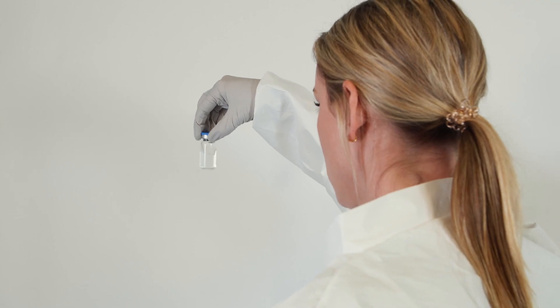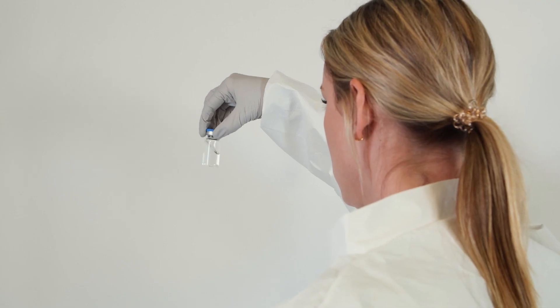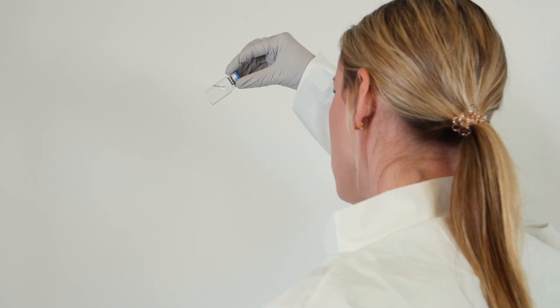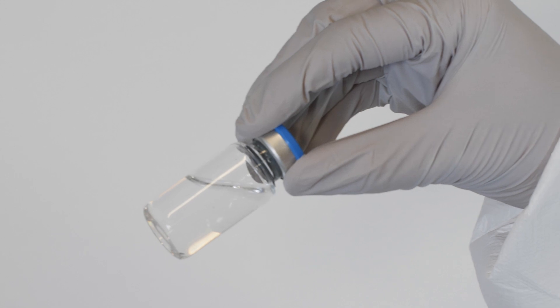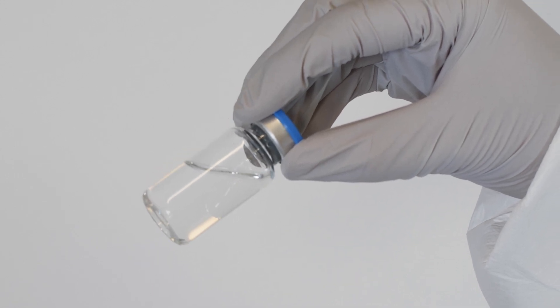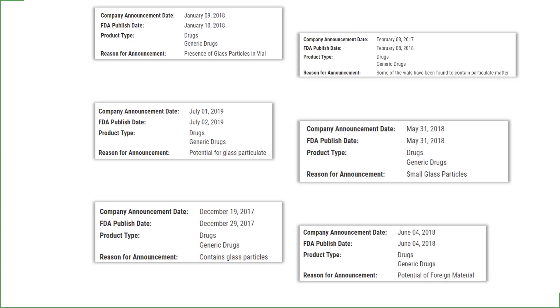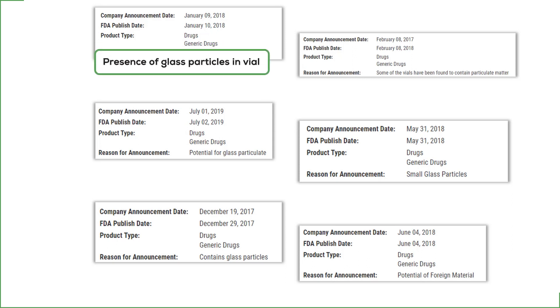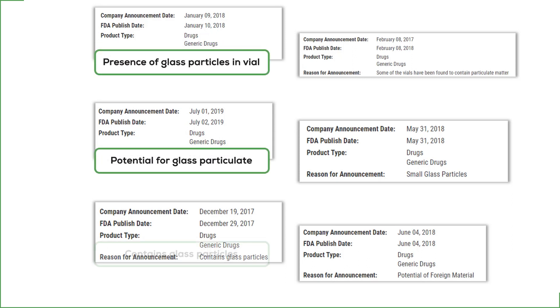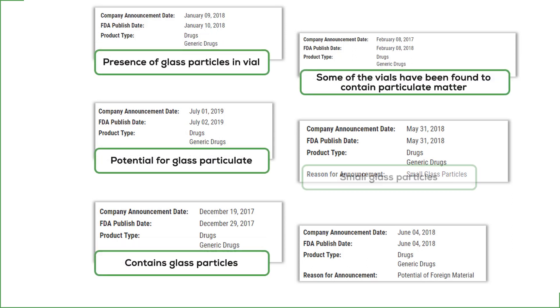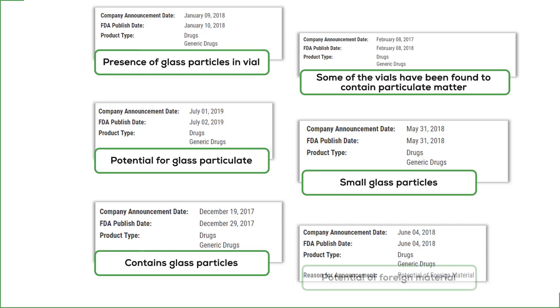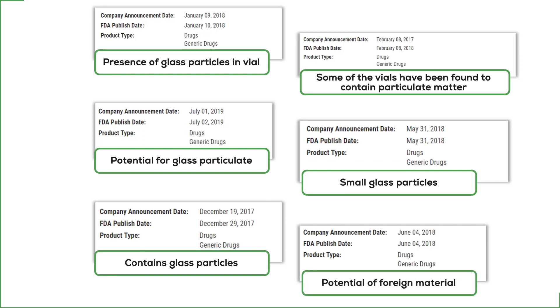USP 790 requires the visual inspection of injectable drugs to ensure that they are substantially free of visible particles. Particles spotted after a drug has been shipped can lead to costly and highly visible product recalls. Hound identifies sources of contamination early in the manufacturing process so that you can avoid this worst case scenario.